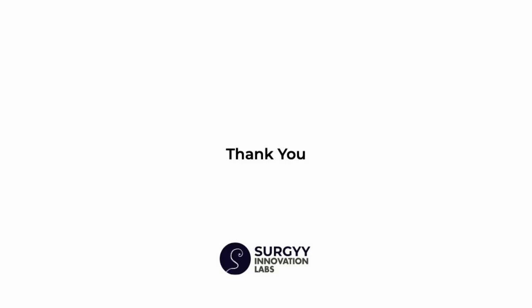Thank you for completing this module on biological spill management protocols. By following these rigorous steps, from initial isolation and donning PPE to the methodical containment and final disposal in biohazard bags, you play a vital role in maintaining a safe environment. Consistent application of these protocols ensures that even high-risk accidents are managed with professional precision, protecting yourself and your colleagues from the dangers of infectious materials.